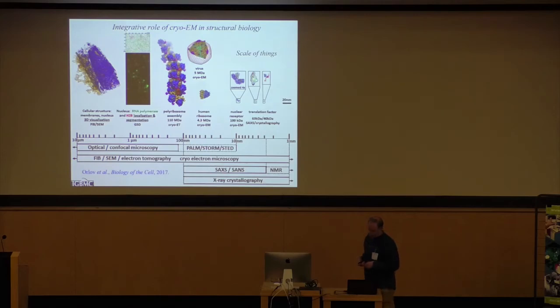Okay, and so the spirit is really this combination, and it's much more than electron microscopy in an isolated manner. It is really integration, combination at the interfaces, and you see that especially fields like super resolution are now coming into high resolution towards the 20 nanometer range. EM is crossing the whole range together with FIB analysis. Yeah. So it's a unique opportunity to go in this direction.